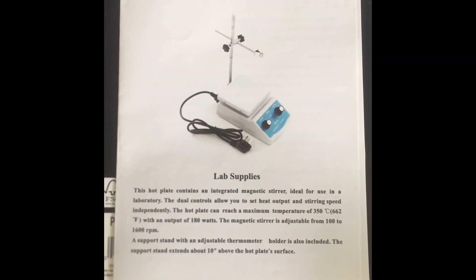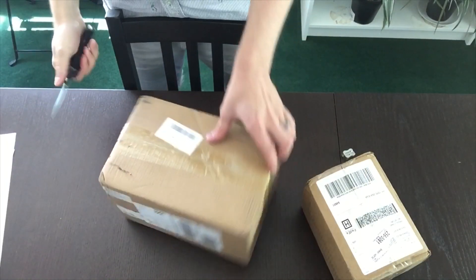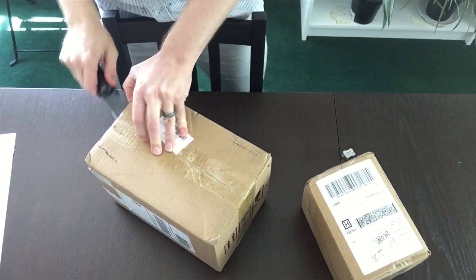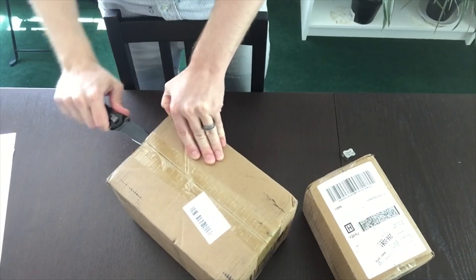This video is meant to help anybody who's interested in buying a magnetic stirrer hotplate from eBay. This will be a review of the SH-2 Magnetic Stirrer Hotplate Duo that I bought off eBay. It cost me $51.80 total, shipping included, and I purchased it from DealParty360.